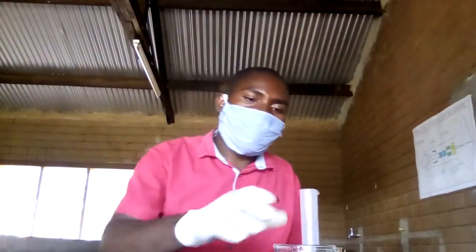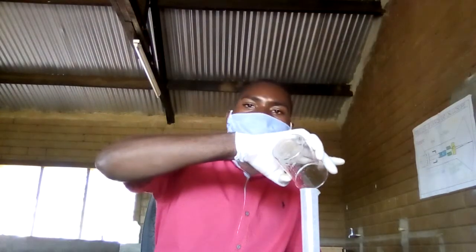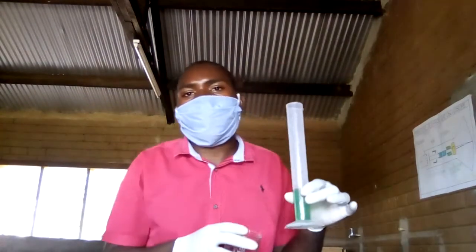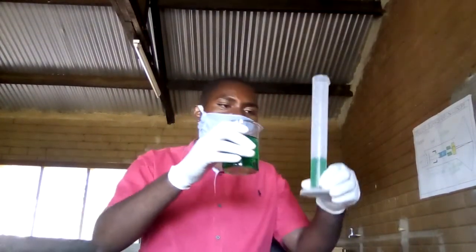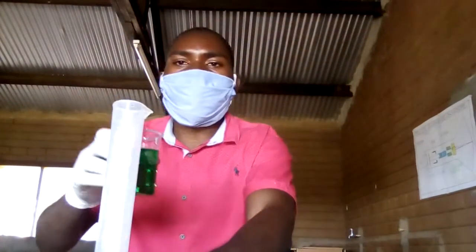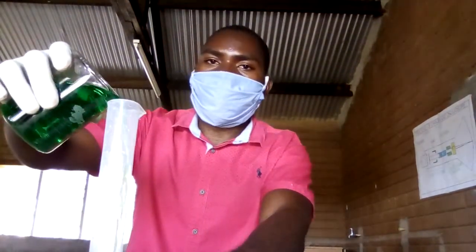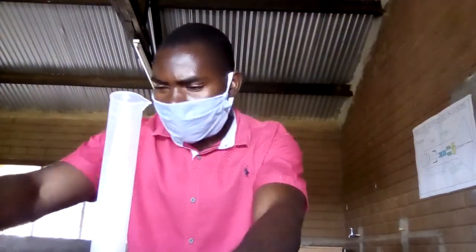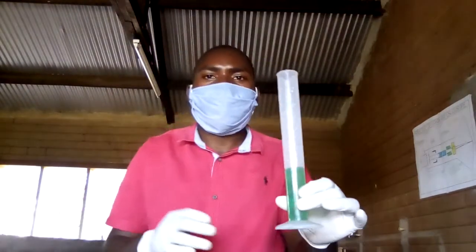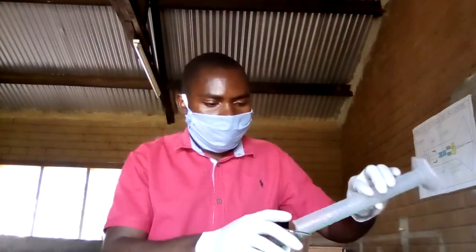Similarly for 40, you're going to pour this liquid inside the measuring cylinder, and once you pour it, the next thing is you need to make sure that you measure about 40 cubic centimeters of this liquid. So I'm pouring it up to 40. Oh wow, this is done already. So this is 40 cubic centimeters. Once you are done, make sure that you get the empty beaker and pour.